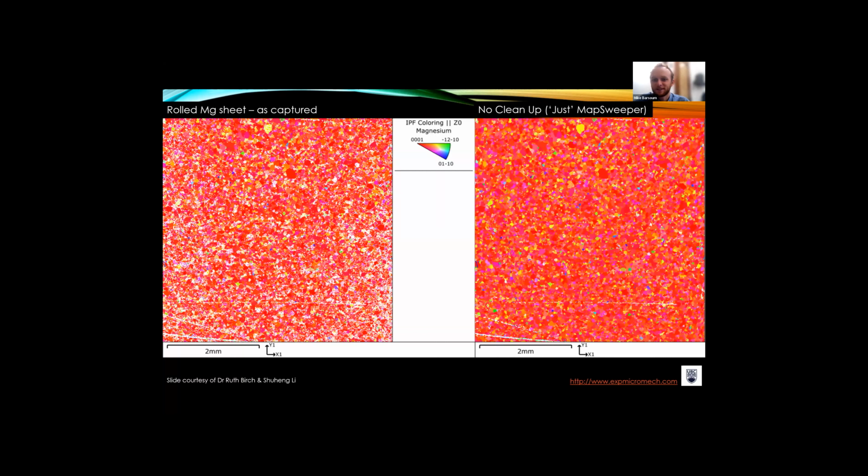Wow. Yeah, thank you for the very complete answer. I think we have time for maybe one more question. And so this question is about severely cold deformed materials and how you can improve indexing on materials like that. For example, they suggest aluminum alloys in terms of time accuracy and accuracy of data. So there's a nice example in the literature from the Carnegie Mellon Group who have used pattern matching to improve the spatial resolution.